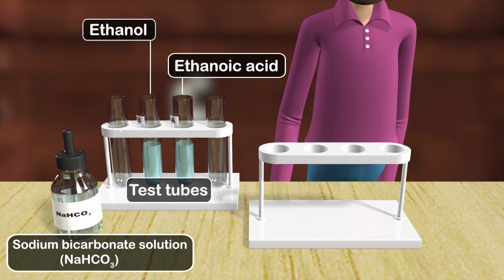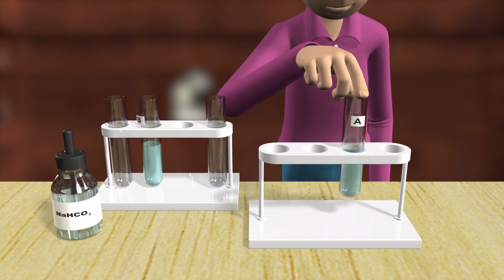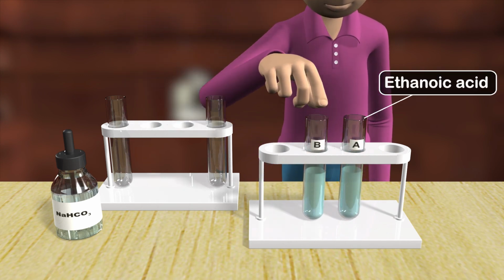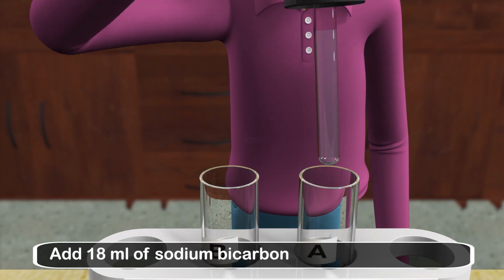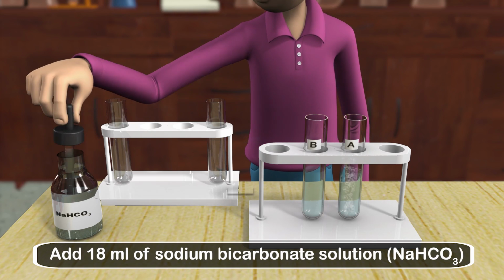Procedure: take 2 test tubes marked as A and B such that A contains ethanoic acid and B contains ethanol. Add 18 ml of sodium bicarbonate solution, NaHCO3, to both the test tubes.